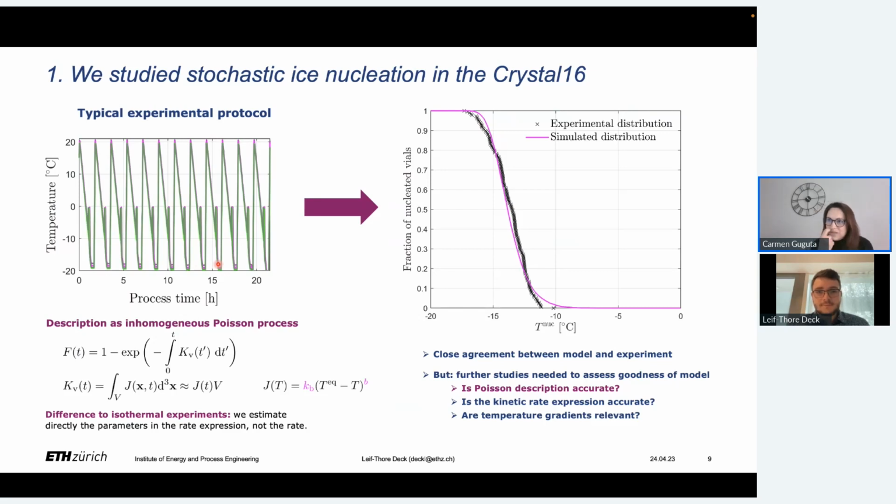And of course, we also did a combination with the feedback control software. I don't know if you have the feedback control software on your instrument. Not sure, actually. The way that you trigger the change from one cycle to another one is not by temperature, but by transmissivity.